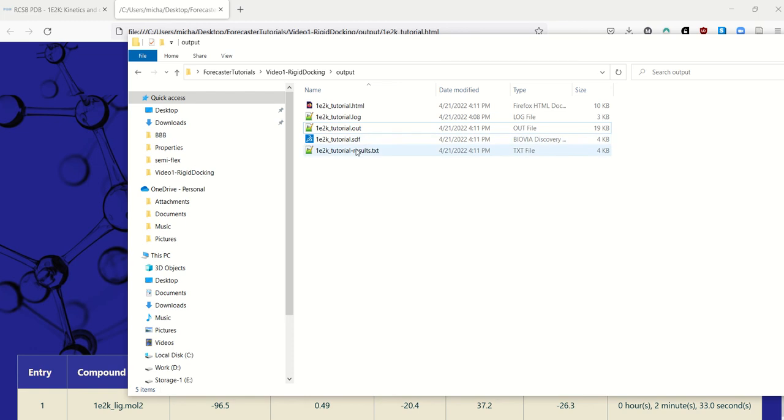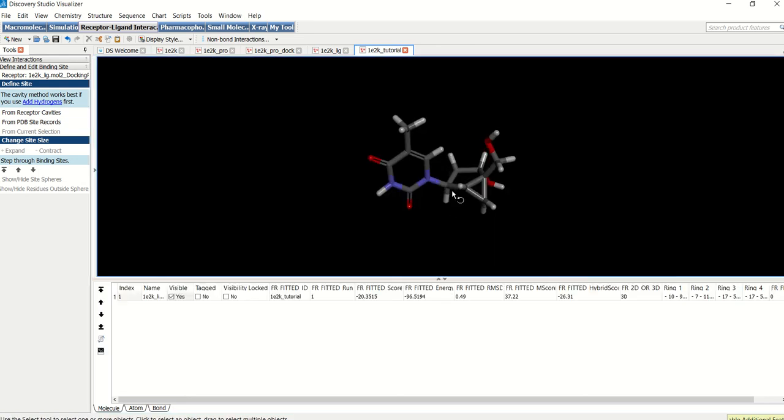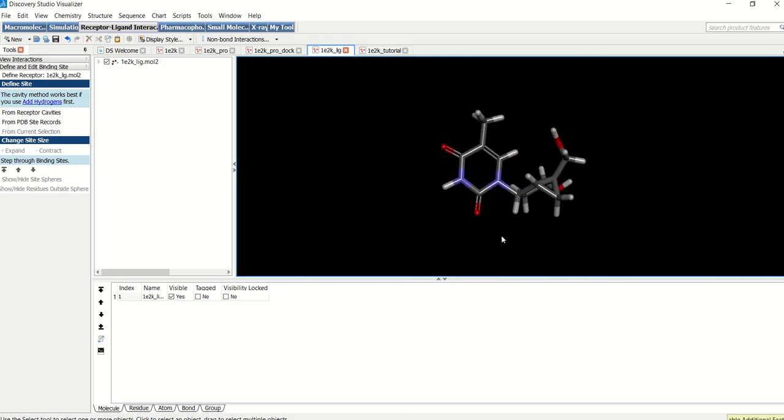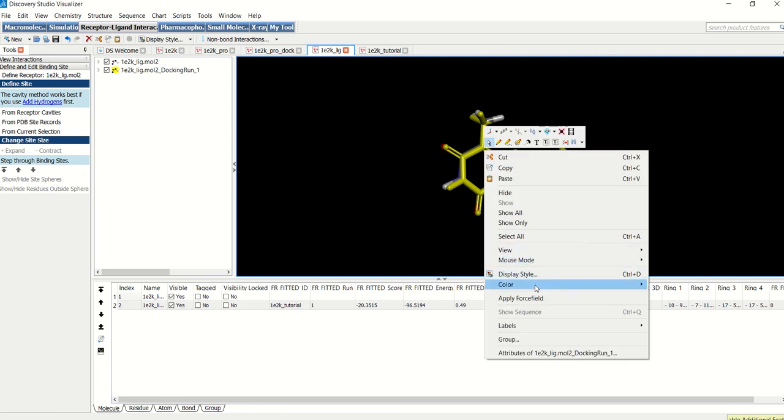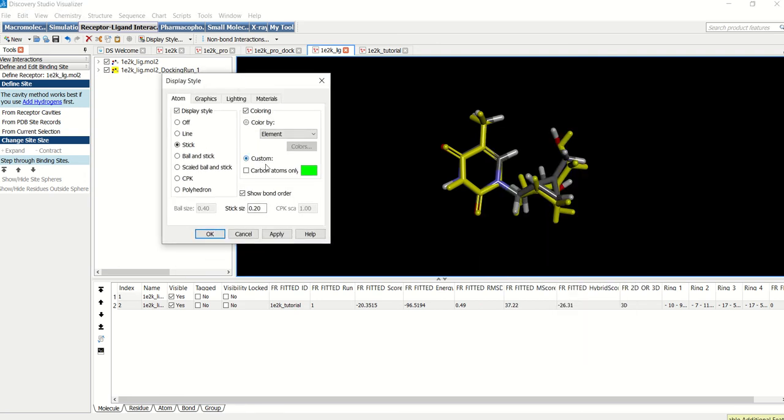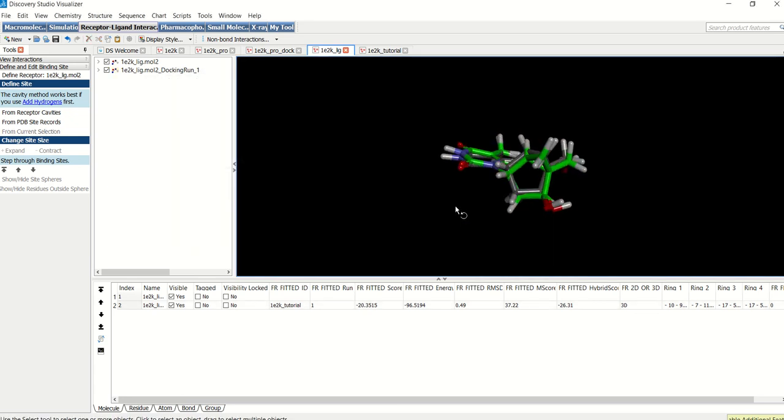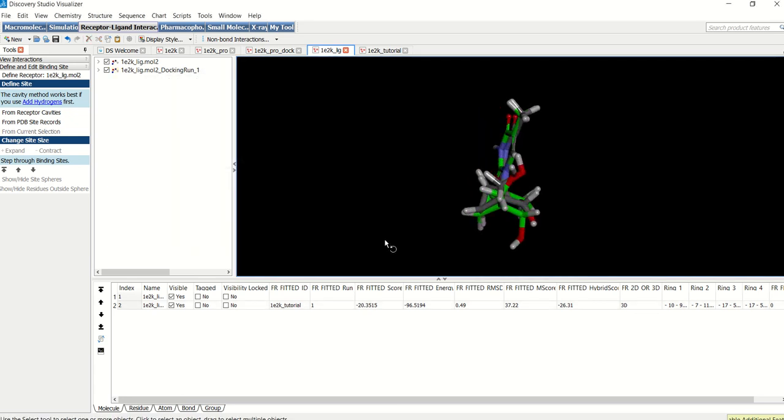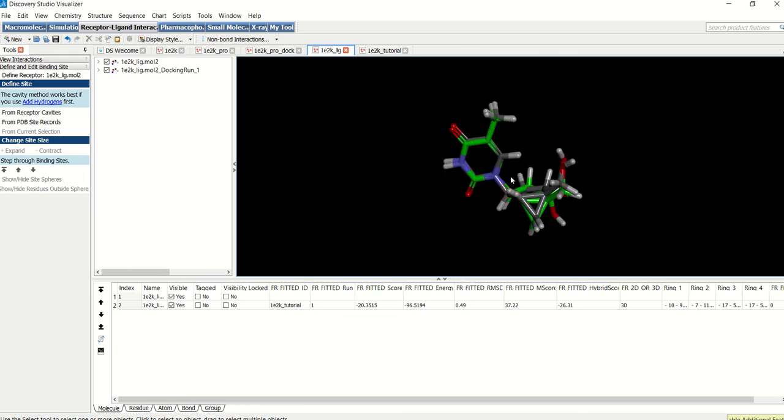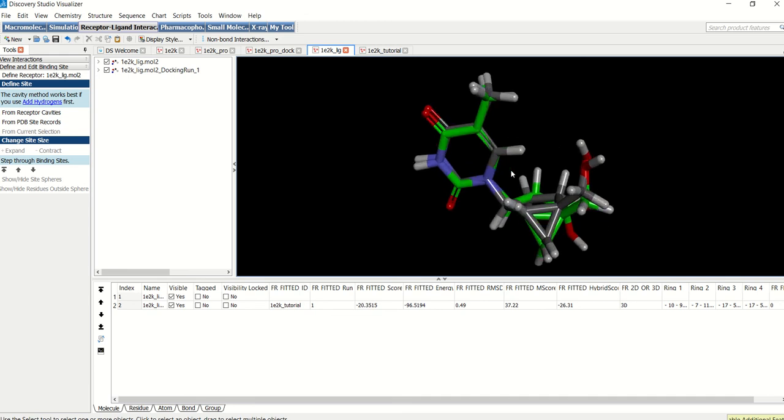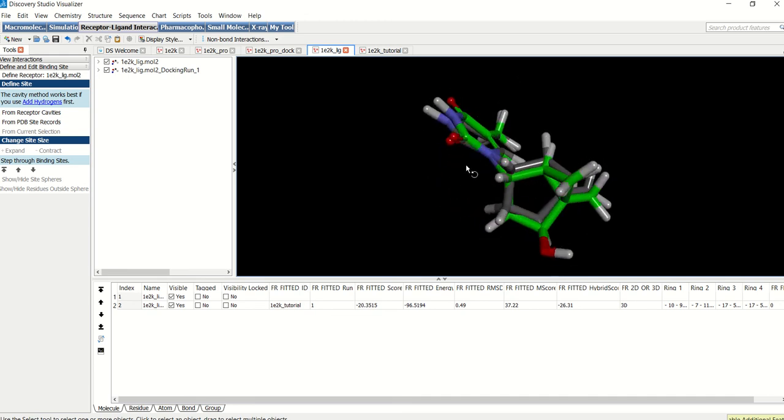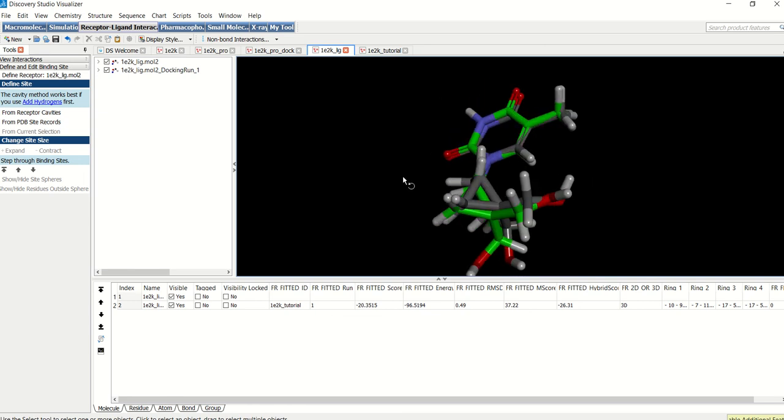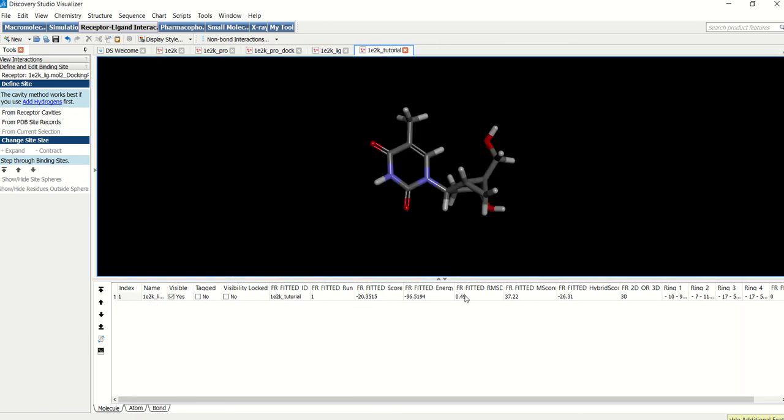And now what we can do is we can open the SDF file that has just been created. And you can see this is the dock pose. And what we can do is we can compare it to the original ligand which is this one. We can change the color so that you can see that there are different components. So you can see how well the two match. In green we have the dock pose. And then in normal colors we have the crystal ligand. So you can see there's an excellent match between the dock pose and the ligand. Such a small RMSD of 0.49 basically tells us that fitted is performing very well at docking to this specific protein.